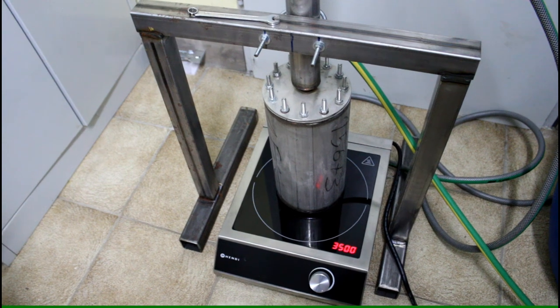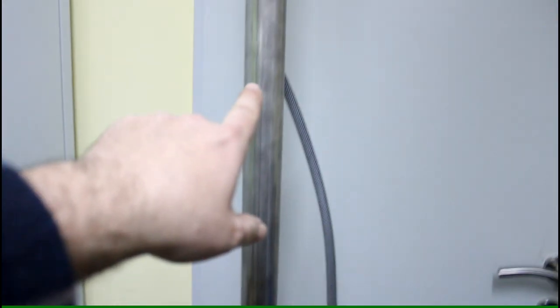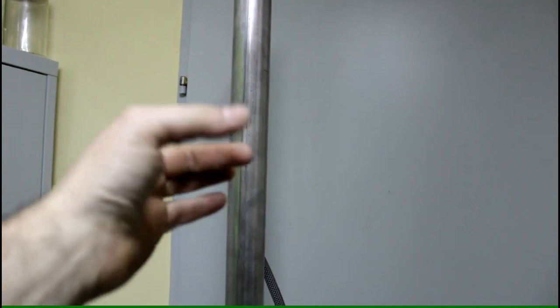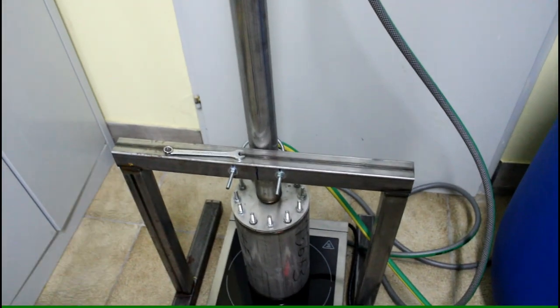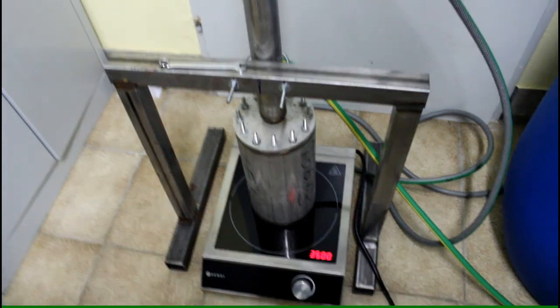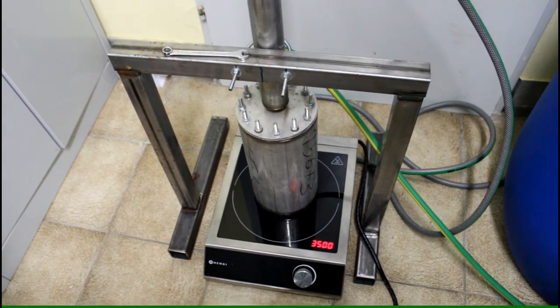Okay, so finally the boil is set up. As you can see here, that's the reaction chamber, and above the reaction chamber we have the reflux condenser. The reflux condenser is basically just an outer tube and an inner tube, and in the outer tube there is water running through, and the inner tube is where the water is condensing and flowing back down. And this is basically just the scaffolding of the whole thing, so that it doesn't fall. And now we're going to let it boil for 24 hours.